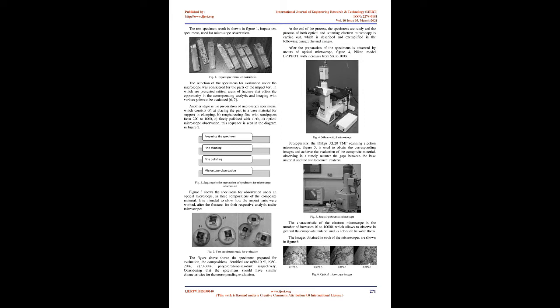The selection of the specimens for evaluation under the microscope was considered for the parts of the impact test, in which are presented critical areas of fracture that offer the opportunity in the corresponding analysis and imaging with various points to be evaluated.